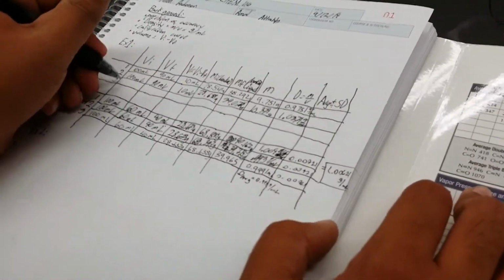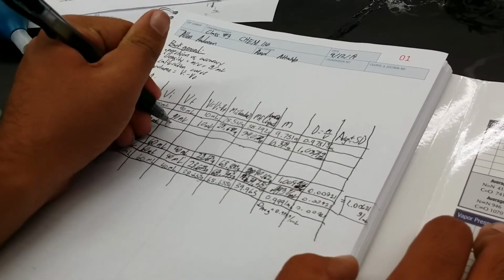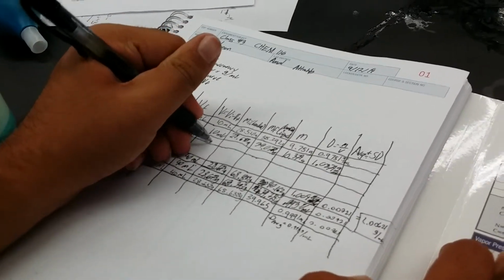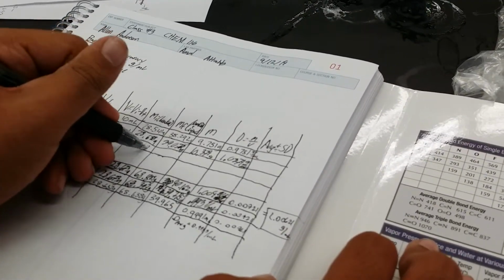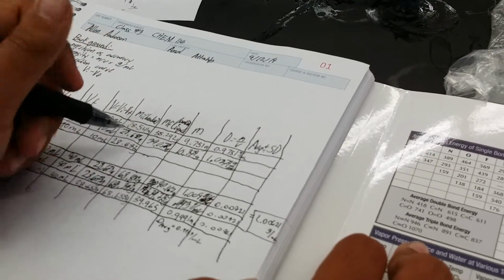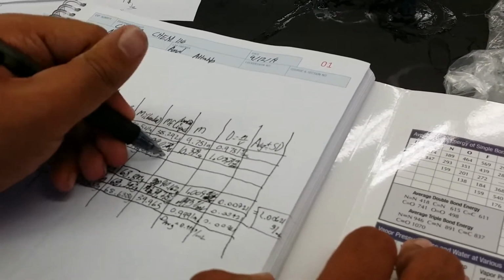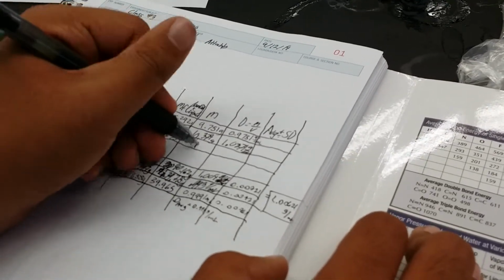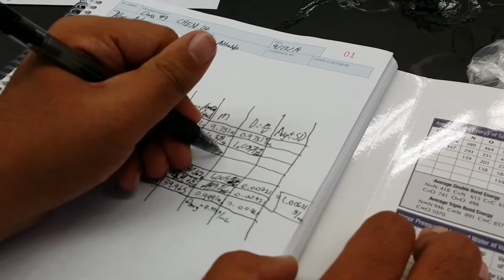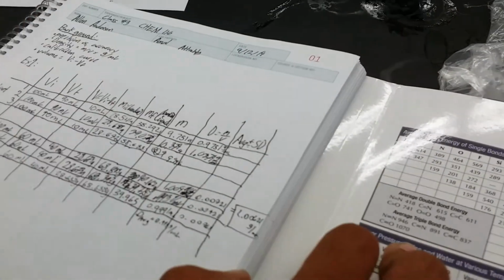So we started off with 100 ml. We took out 10, so that means we had 90 ml left. There we go, 10 ml there. So this is 28.677 grams. And the mass of the final was 38.673. And the mass difference was 9.996. Divide that by 10, because we have 10 ml here.